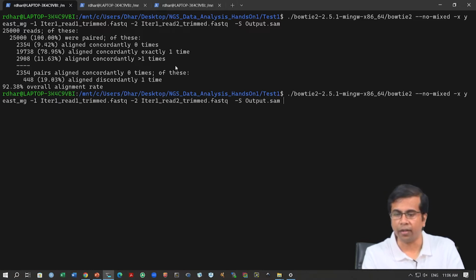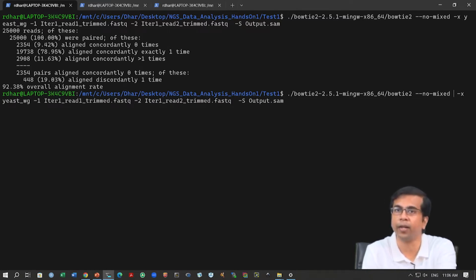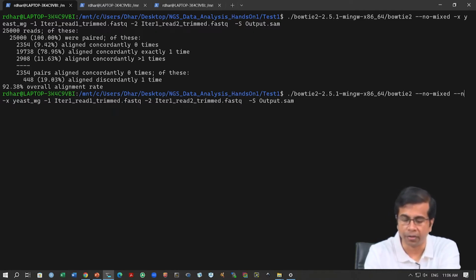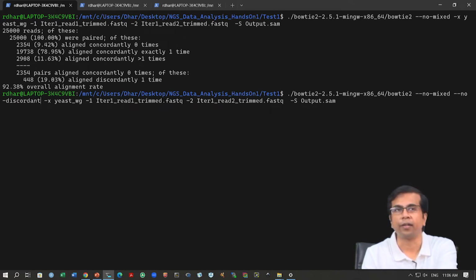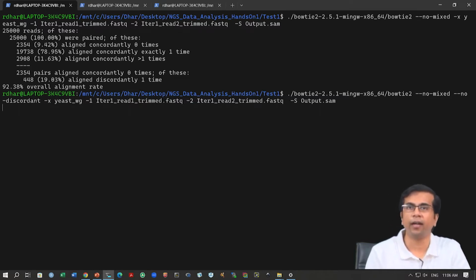We can also try --no-discordant. We can simply add this to this command, so we have both --no-mixed as well as --no-discordant. So, let us try that. I have just written --no-discordant, and I will press enter and it will run again and give you some statistics. And what do you expect?